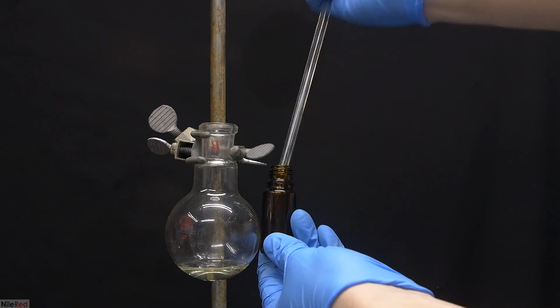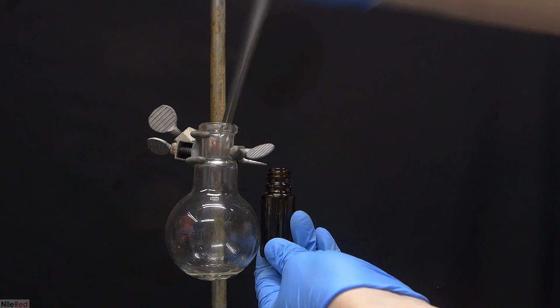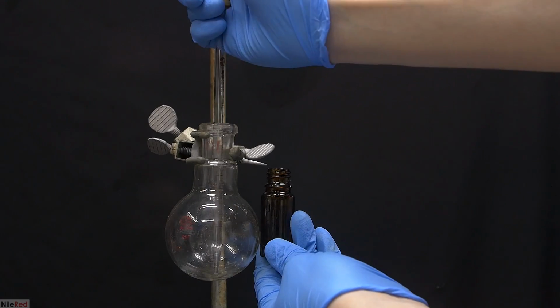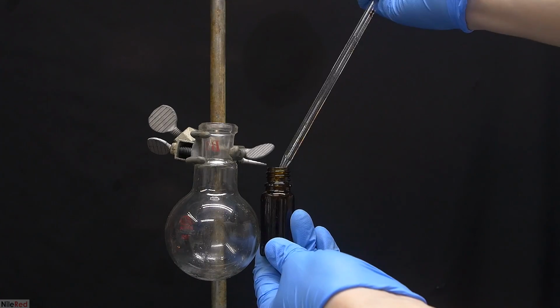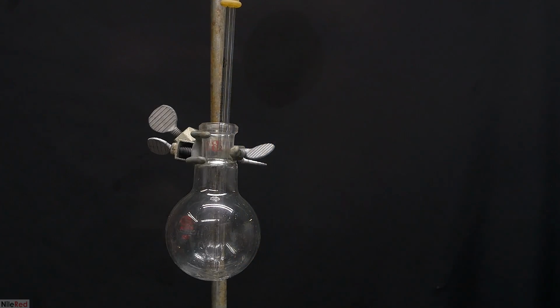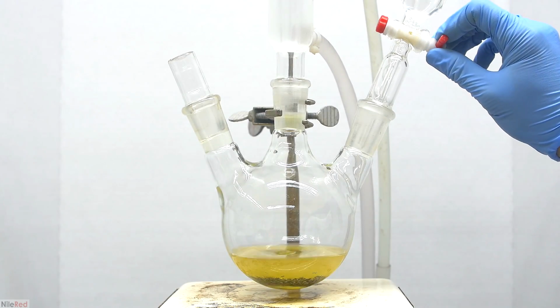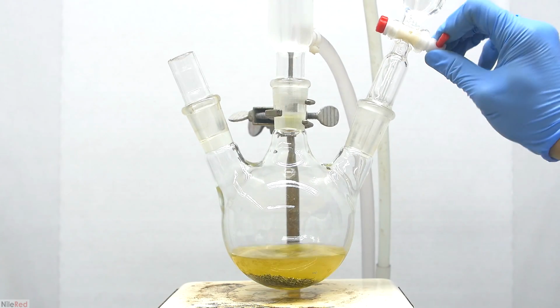Hexanoic acid, which is also known as caproic acid, is a pretty stinky compound. It's a colorless, oily liquid, and its odor is often described as goat-like or like other barnyard animals. I think its odor is pretty similar to that of butyric acid, which is responsible for the smell of vomit.